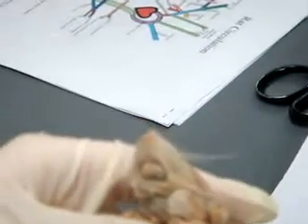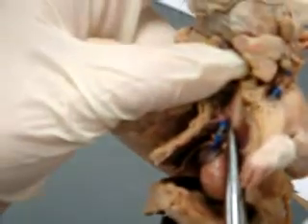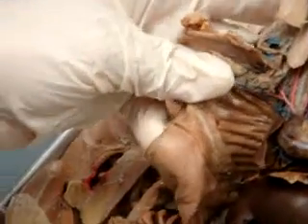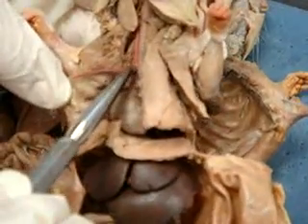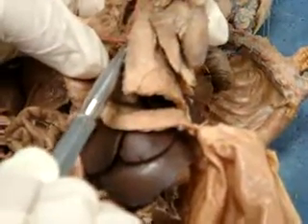All of these can be in a little different place on your rat, because it just so happens that the circulatory system is one of the most variable systems for having things in different places than any other system. How do you differentiate the internal thoracic with the costocervical? The internal thoracic is this long one and it's the first one that branches off to the side. The costocervical goes into the back and down. The vertebral also goes into the back.